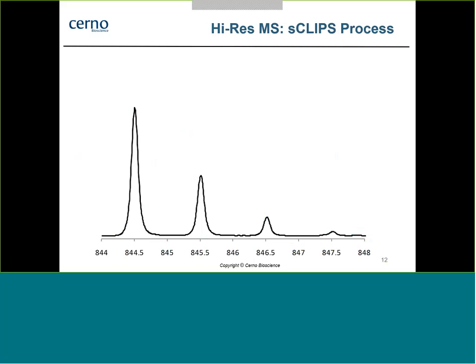Now, it's interesting, when you go to high resolution mass spec, in the low resolution systems, what we'll typically do is we'll measure a known ion and we'll calculate the true mass spectrum from first principles, and we'll use that in our calibration. But the interesting thing is that in high resolution, you'll see that the monoisotopic peak here is well resolved from A+1, A+2, etc. So in principle, the neat thing about this is that the monoisotopic peak is isotopically pure.